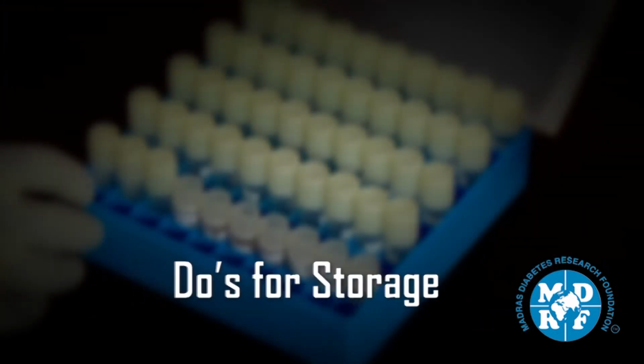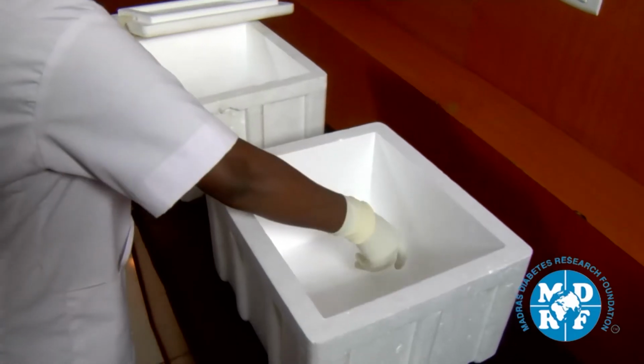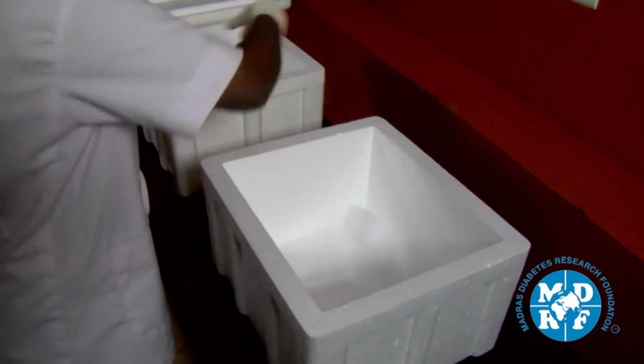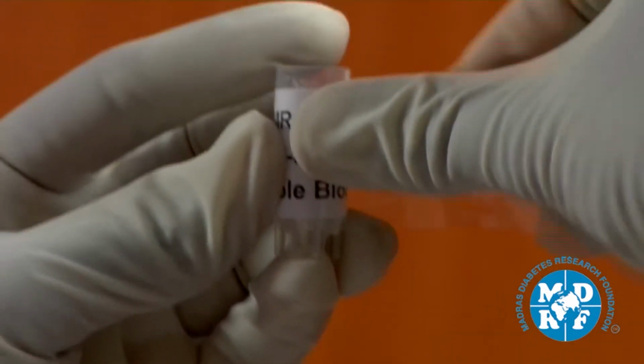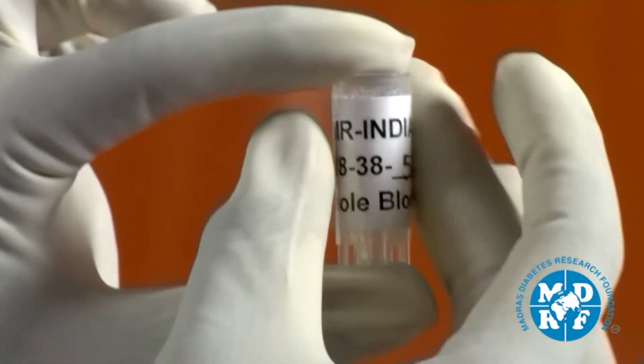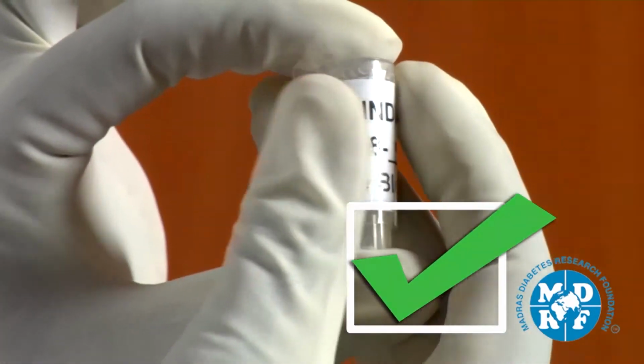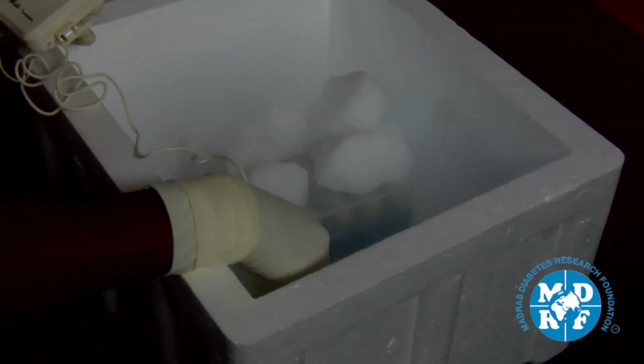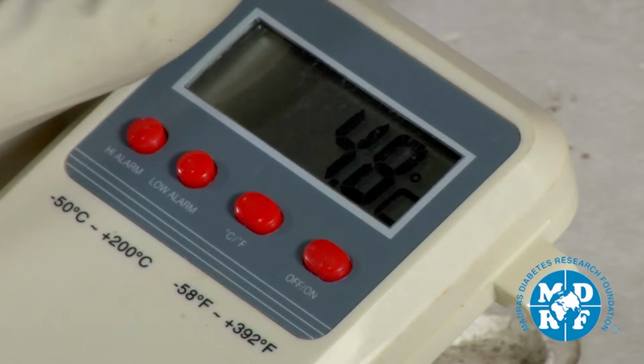Do's for storage. Make sure that there are sufficient ice packs or dry ice in the box before packing. Always seal the sample vials with sellotape before transporting. Keep the vials straight up. Always ensure that the temperature in the ice box is between 2 to 8 degrees centigrade.